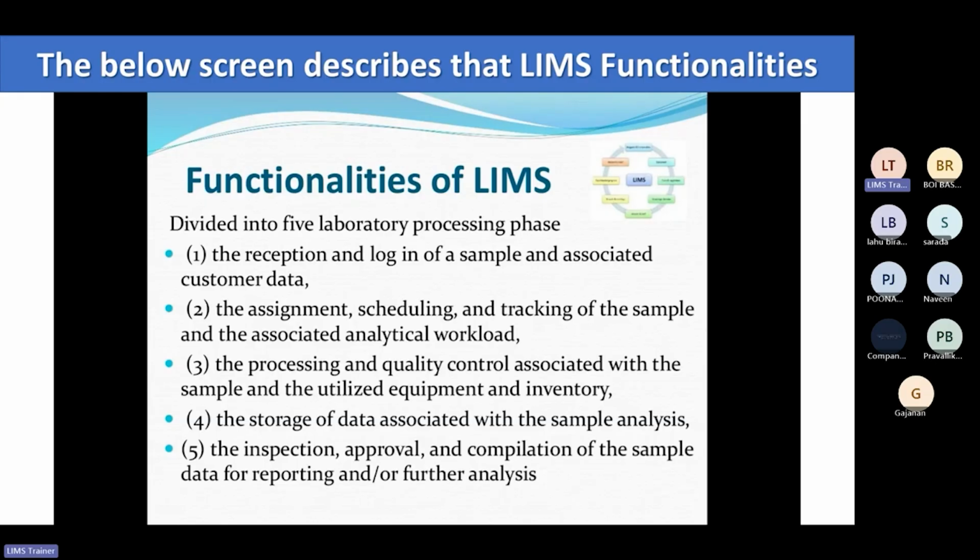The manager will assign that particular sample to some end user or analyst to analyze. Then it will be scheduled. Then the tracking of the sample. These are the functionalities related to the sample. Then comes the processing, then quality control associated with the sample, and the inventory related to that particular laboratory.